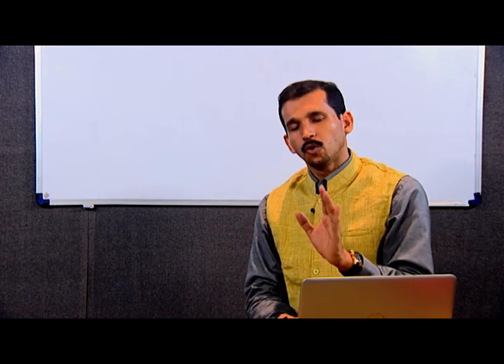We need only K alpha 1, and most of the K alpha 2 is cut down with the help of some kind of blocking mechanism which we apply externally, and also the modern spectrometers have a software correction to cut away the K alpha 2.